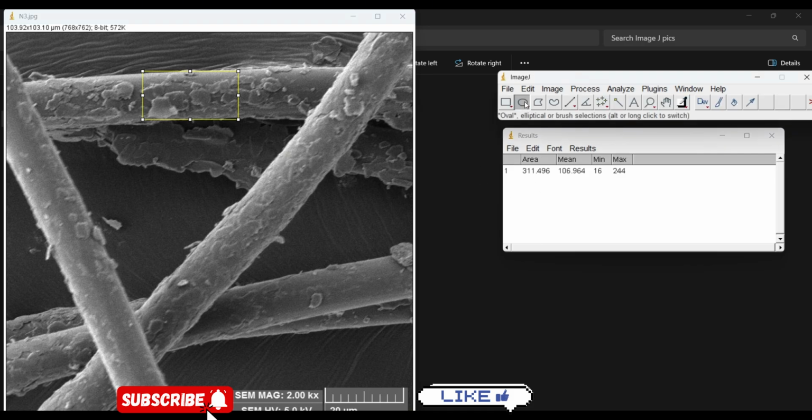There are other options as well, like this oval shape. You can make it here, and you can drag from the points and make it oval or circle, whatever you want. Control M, and this is the area of this oval shape. You can measure some angle here as well, this and this.